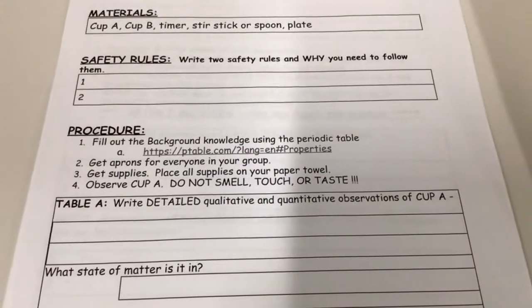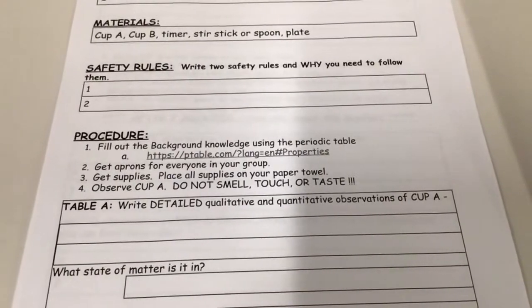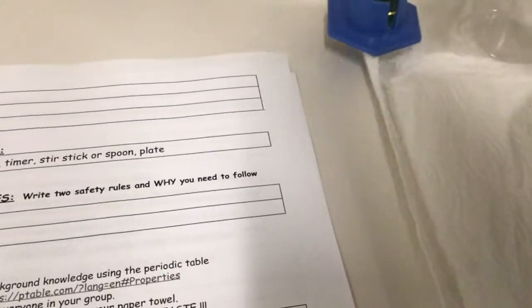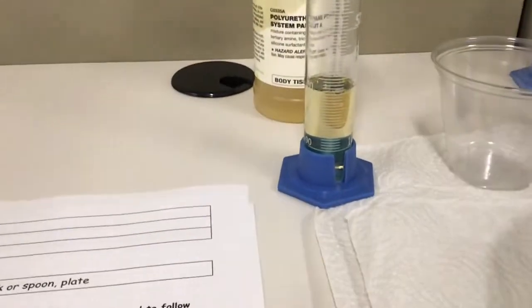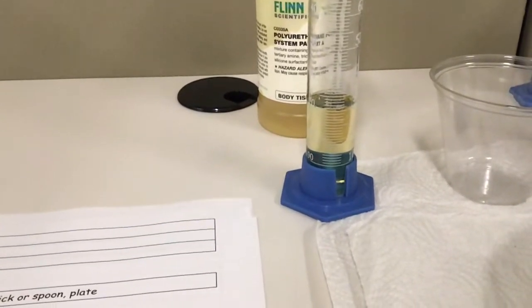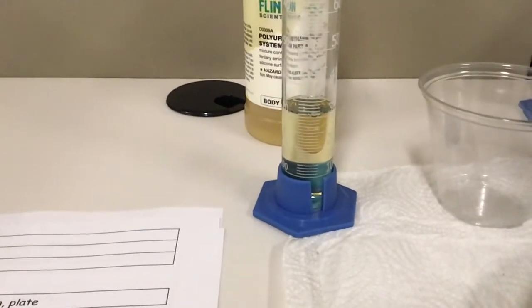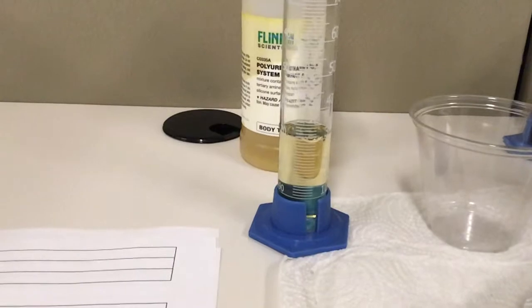All right, so it says Table A, write down detailed observations about cup A. So I have not filled it in yet, meaning I have not poured it in the cup, because you can record qualitative and or quantitative observations. I have 30 mils of the cup A solution.